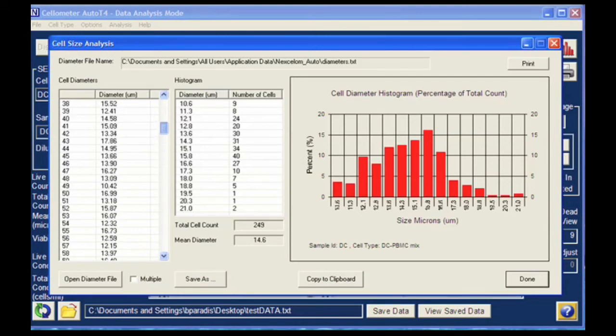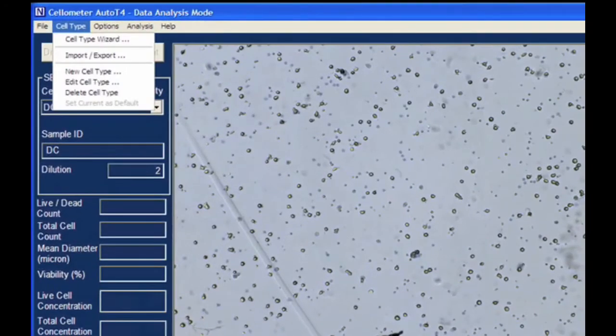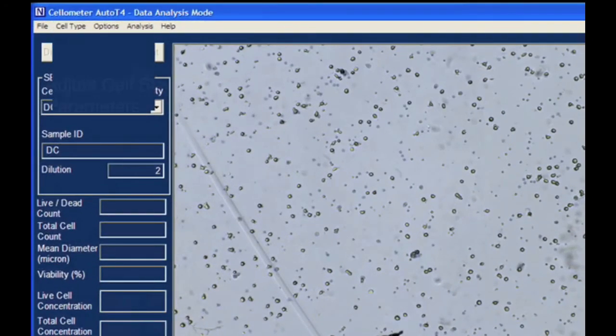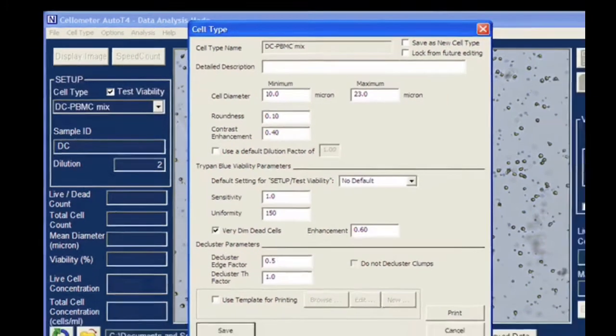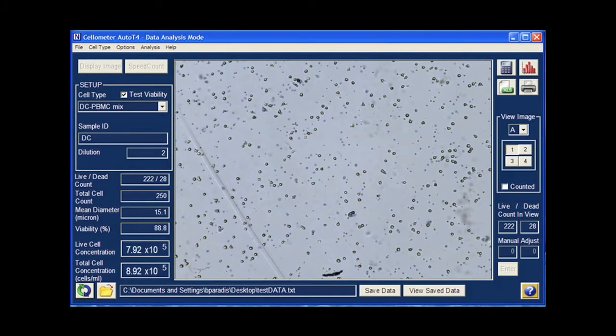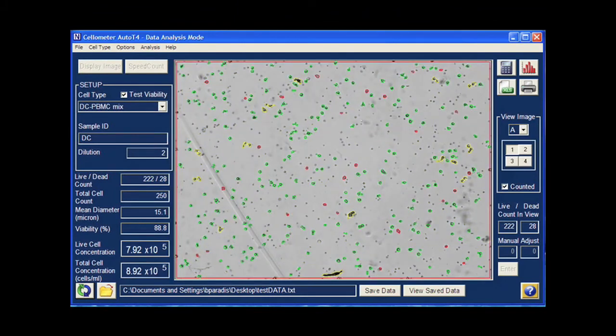The minimum and maximum cell size in the Cell Type Editor can be adjusted to obtain concentration and viability calculations for a specific cell size population. This image demonstrates counting of mature dendritic cells from cultured PBMCs.